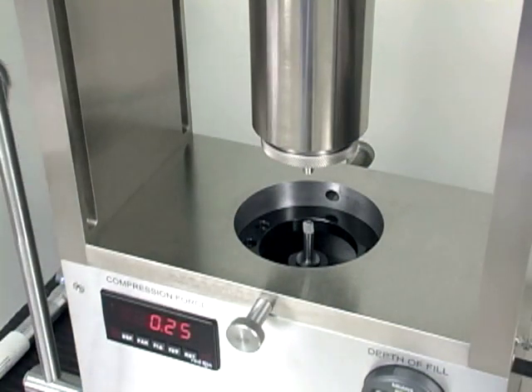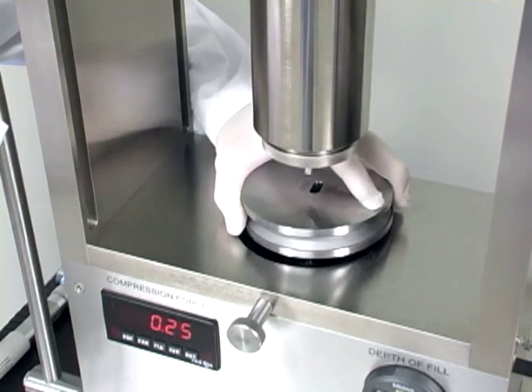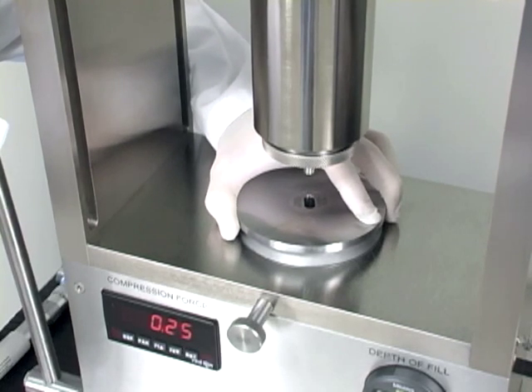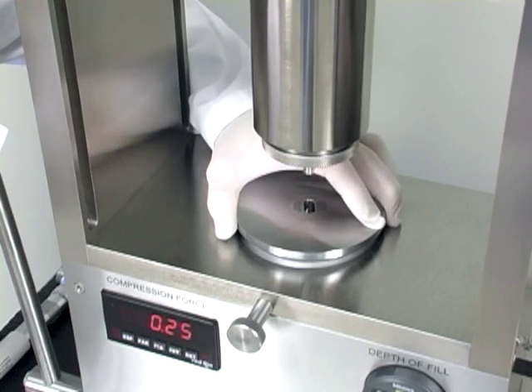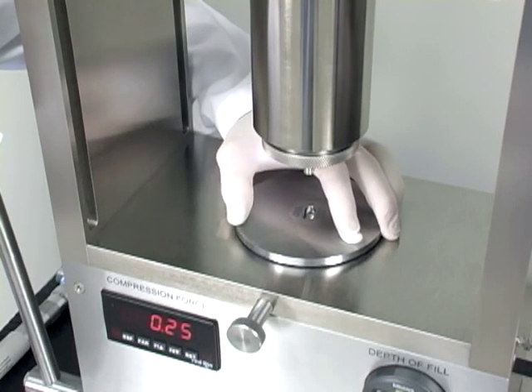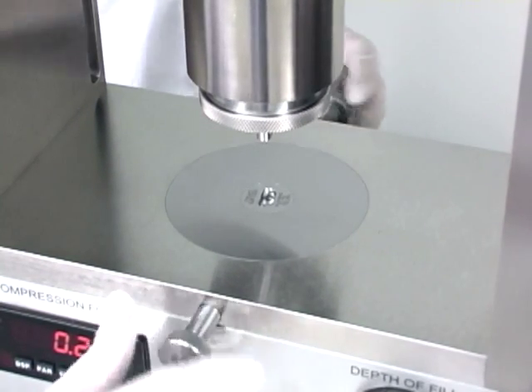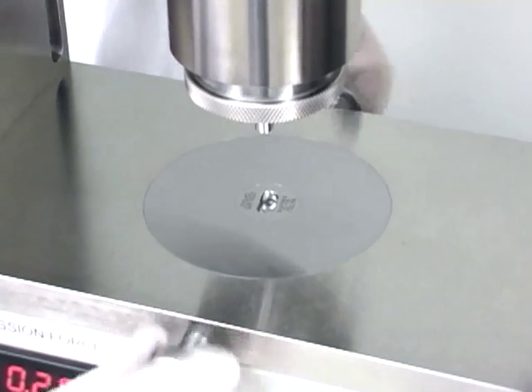After the die is installed in the die holder, place the die holder over the die platen hole. Raise your ejection lever and locate the lower punch, paying careful attention not to damage it. Once the die holder is installed on the die platen, it's time to lock the die lock knobs down to hold the die holder in place.